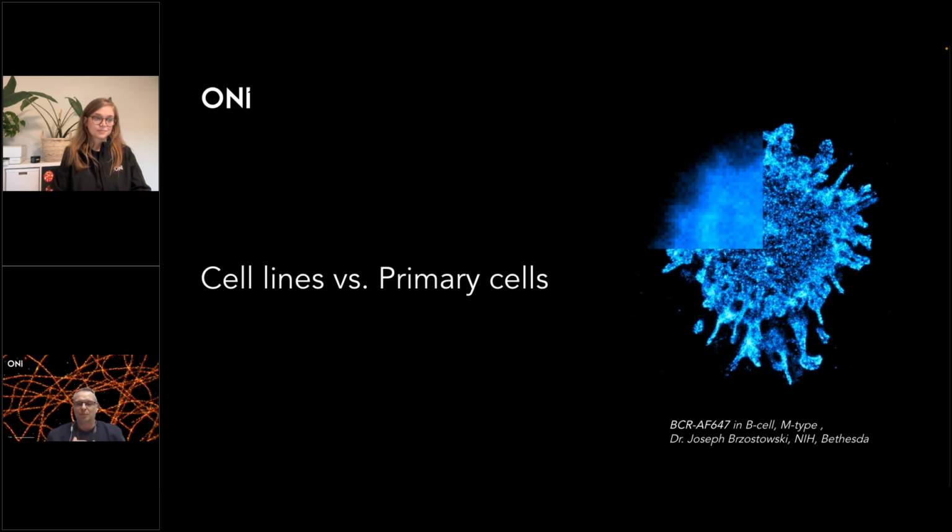because the working distance, or the penetration of the objective into the depth of the sample, is in the range of almost centimeters. But when you increase the magnification and want to look at an individual cell or individual organelles within a cell, suddenly the working distance from the objective is much smaller, somewhere around 170 microns. So you really need to watch out that your glass is not thicker than about 100 microns, because the thickness of the glass also matters.